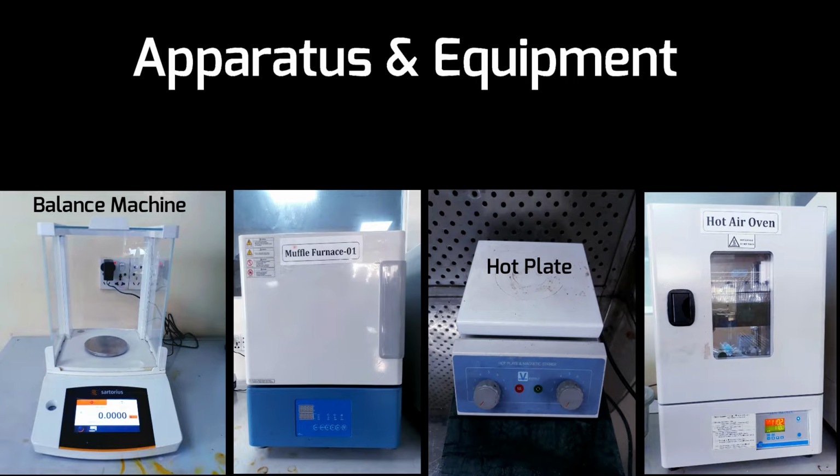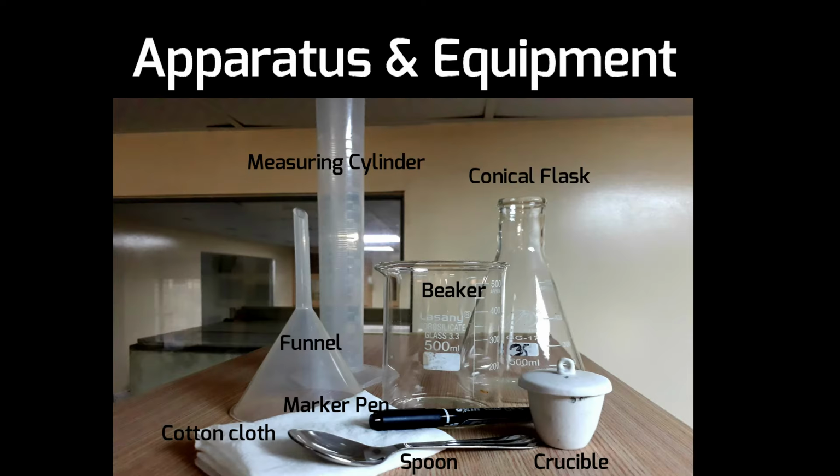To do the test, we need some apparatus and equipment like balance machine, muffle furnace, hot plate and hot air oven. Among the glassware we need measuring cylinder, funnel, crucible, conical flask, beaker, cotton cloth, marker pen and spoon.